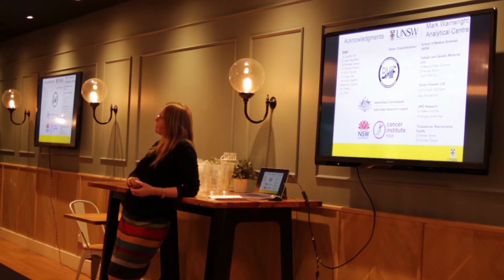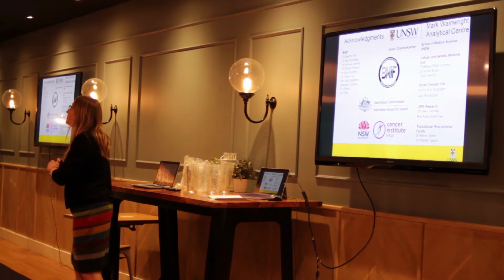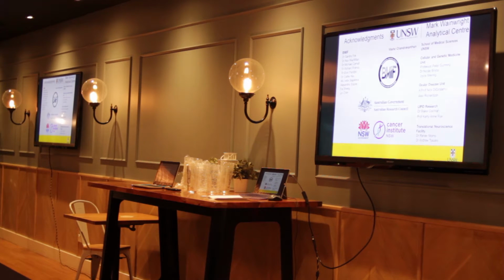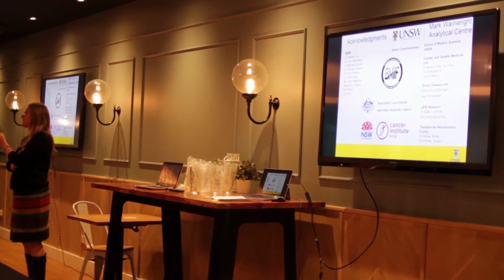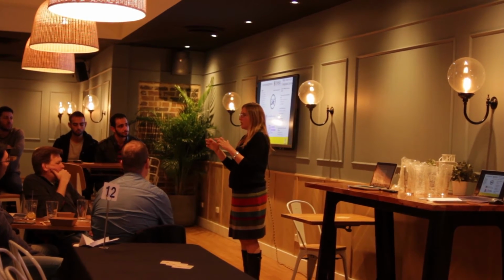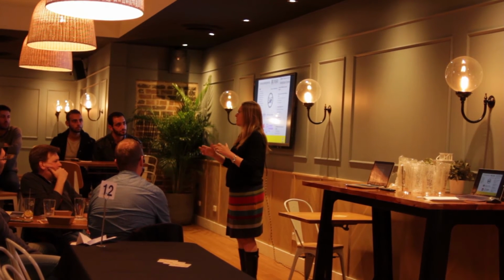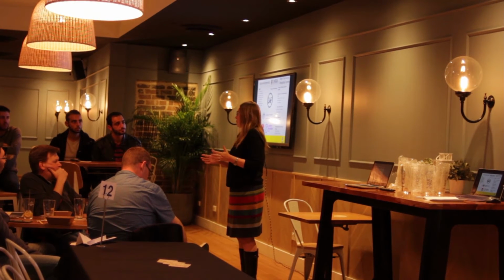I understand that you use a lot of confocal microscopy for a lot of your qualitative information. But would you use flow cytometry on a larger scale for your quantitative stuff? You've raised a really good point. Microscopy is only one tool in a researcher's toolbox, and you have to always gain perspective that if you're only looking at one cell in a dish of cells, you've got to be very careful about generalised readings that you make about it.